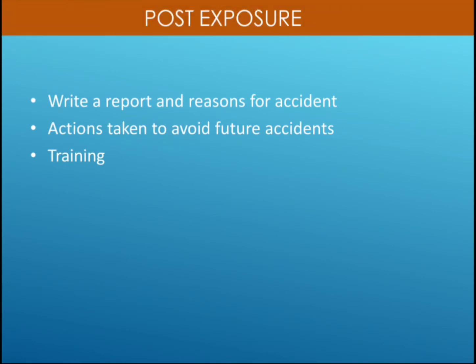Next we have to write a report after post exposure, means after the person is exposed to the laboratory pathogen or any other risk. Then we have to write a report with the reason for the accident and actions taken to avoid future accidents. And training should be given to the personnel on what will happen if we face such accidents in the future.